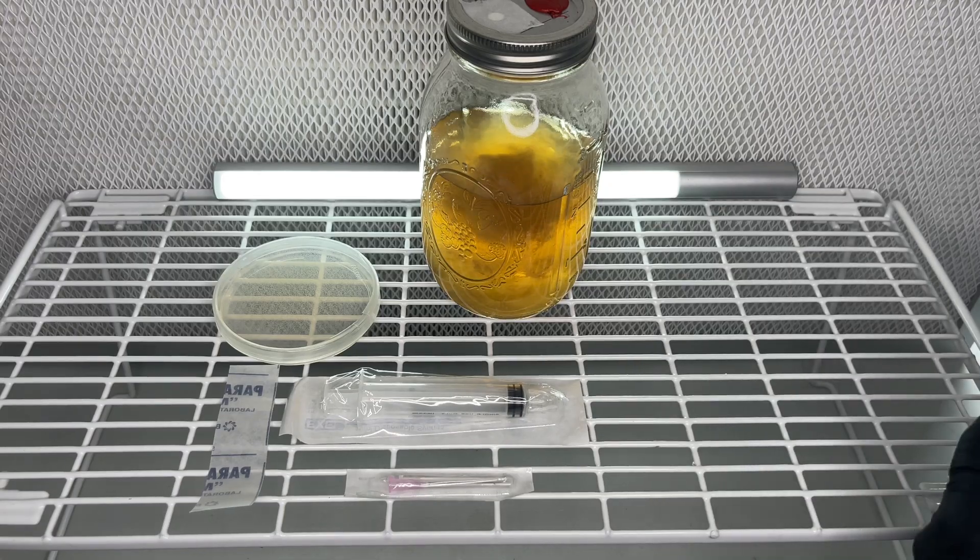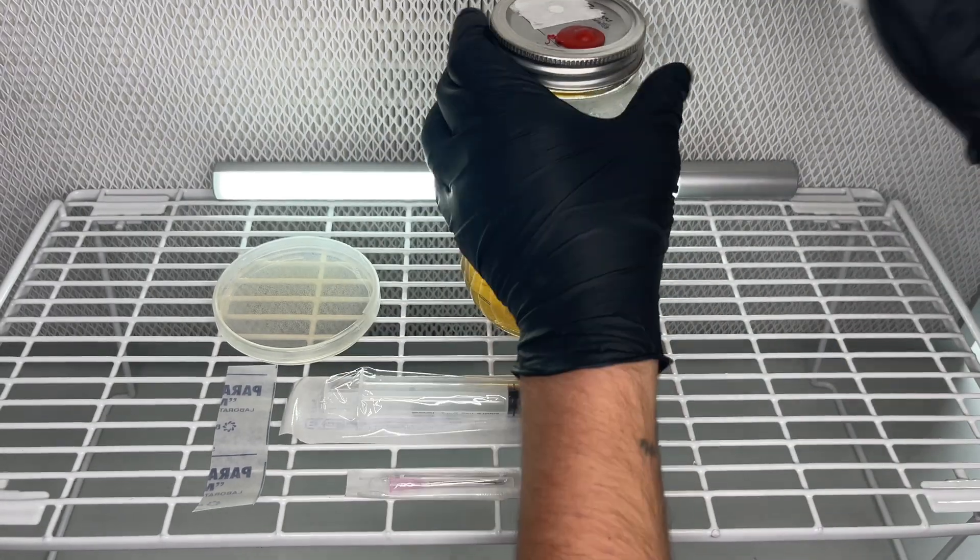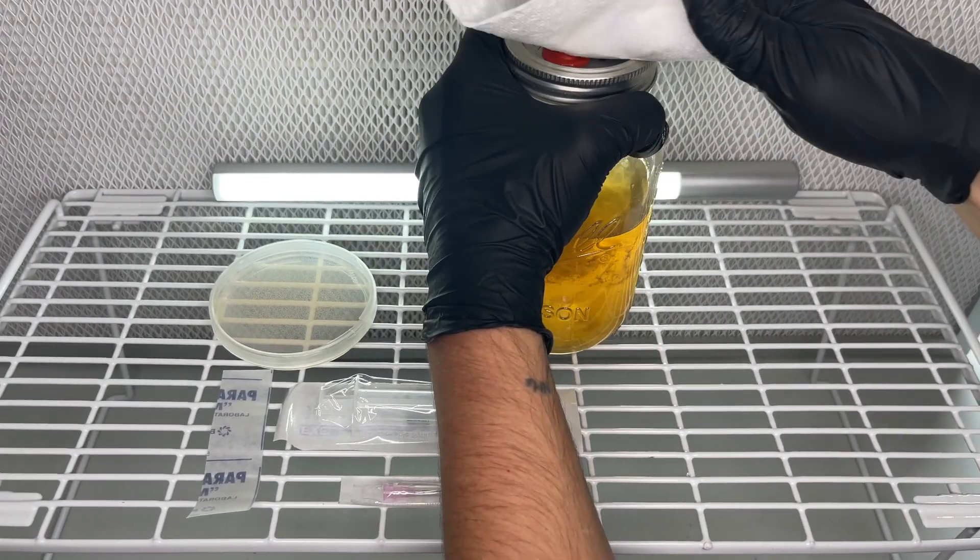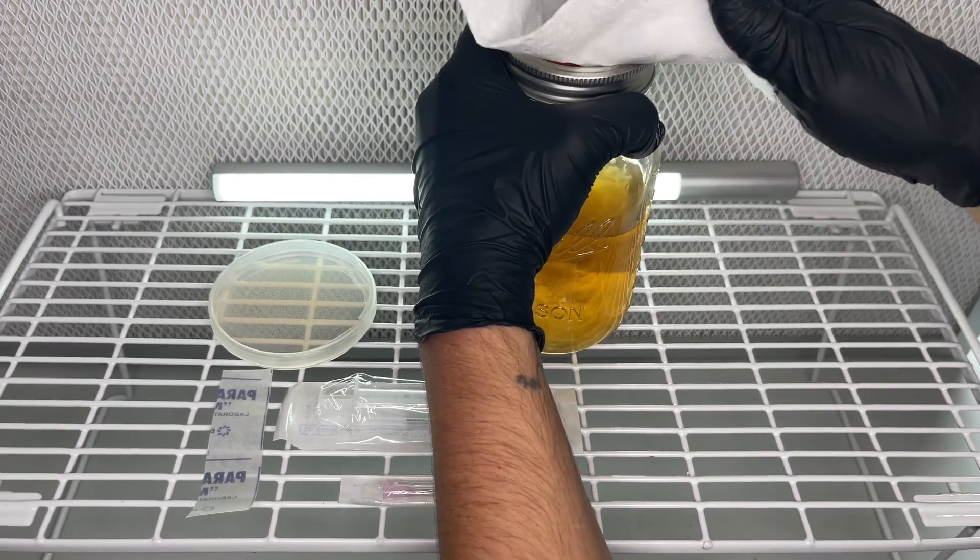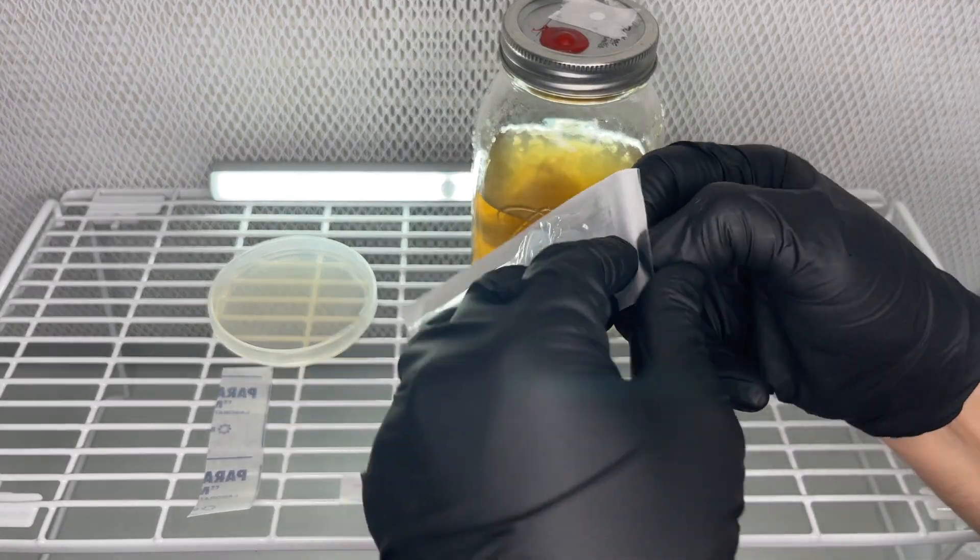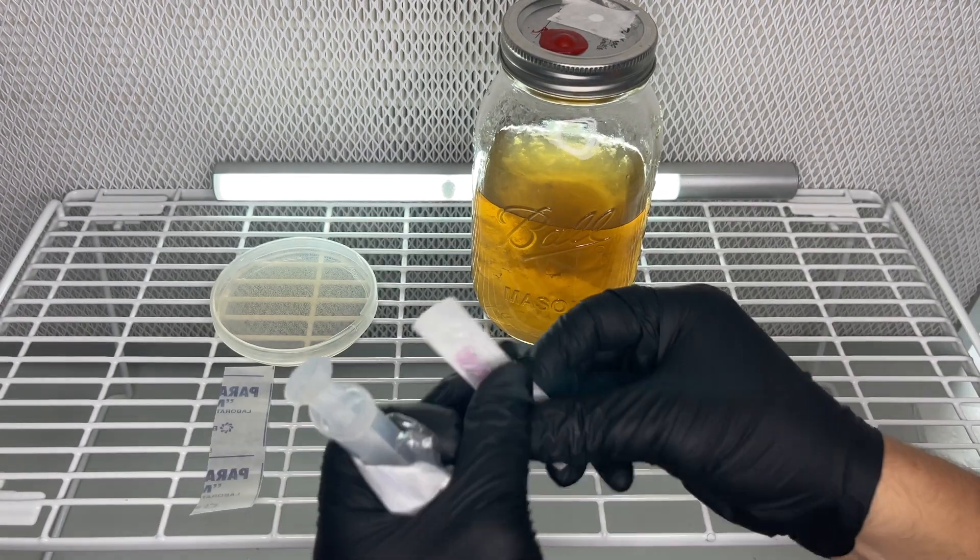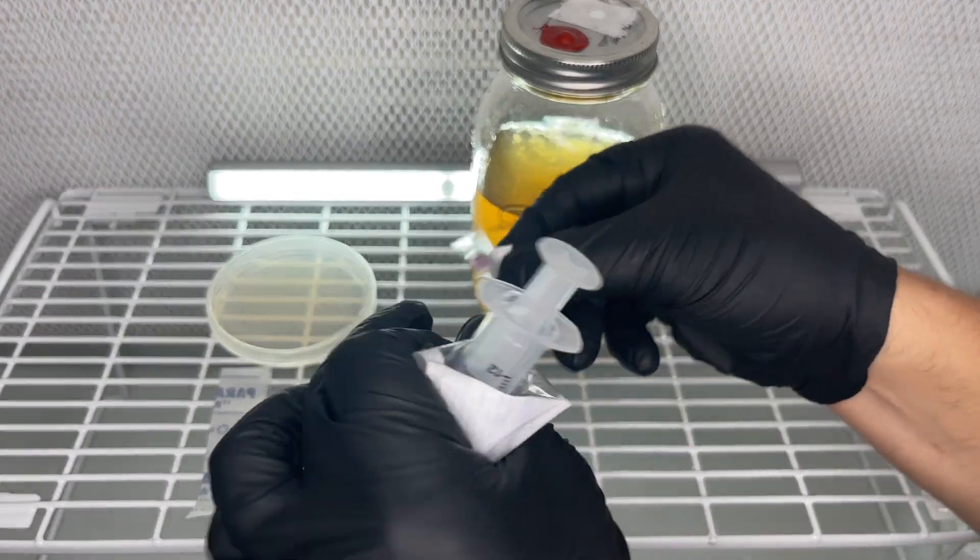Many times a contaminated mushroom liquid culture can look totally normal and go undetected, and if it makes it into the next process of making grain spawn, it can create major problems and even cause your grow to fail completely.